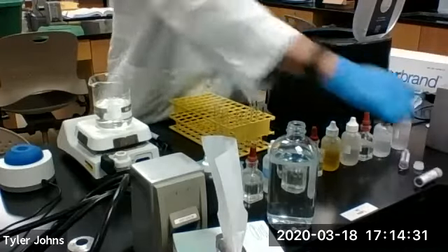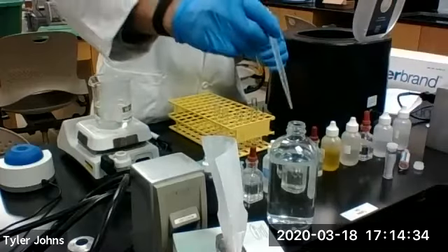We're going to dilute to 2 mL with water.